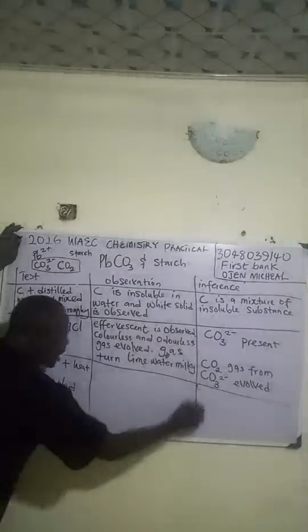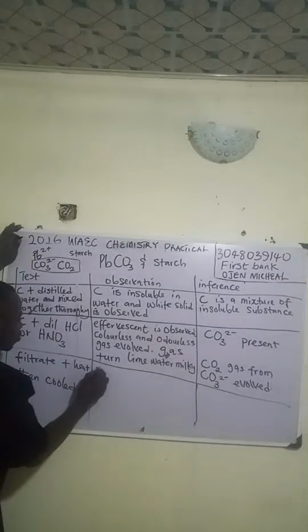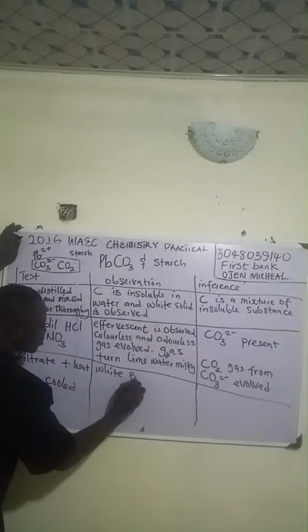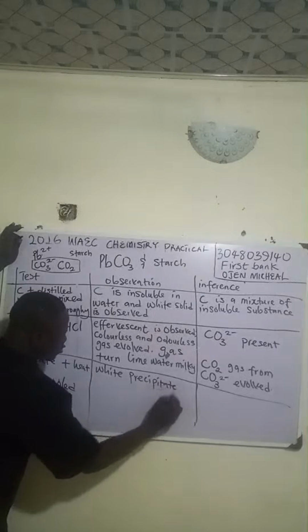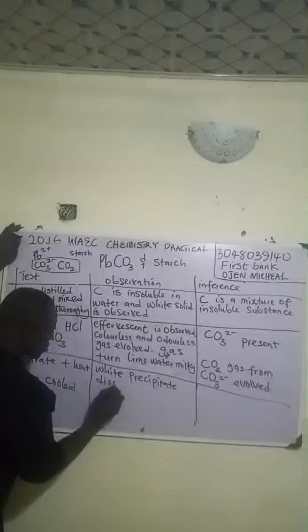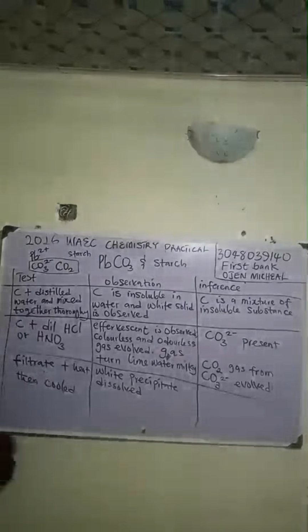When you heat this one now, what you are going to see is that white precipitate dissolves. White precipitate dissolves.